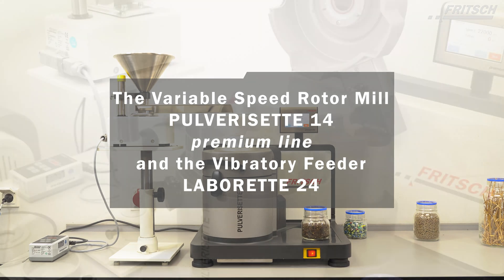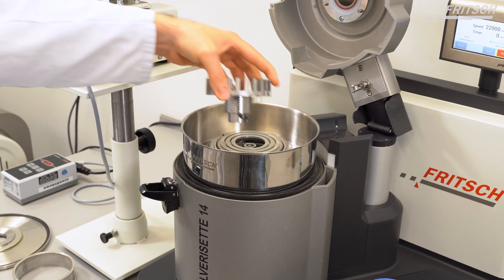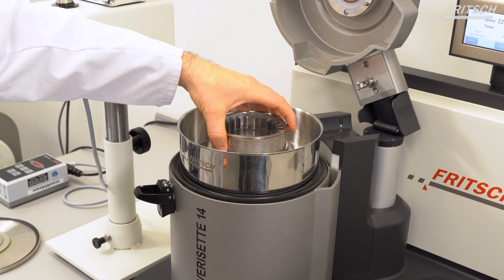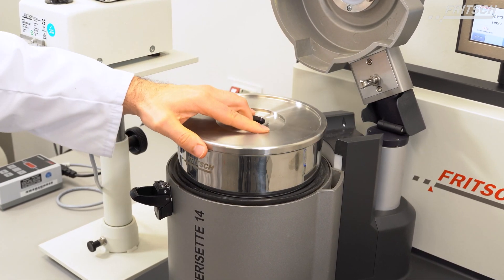For the comminution of green tea leaves, we use the Fritsch Vibratory Feeder Labourette 24 and the Fritsch Pulverisette 14 Premium line. The P14 Premium line is equipped with a 24-rib impact rotor and a 0.5 mm sieve ring with trapezoidal perforation.